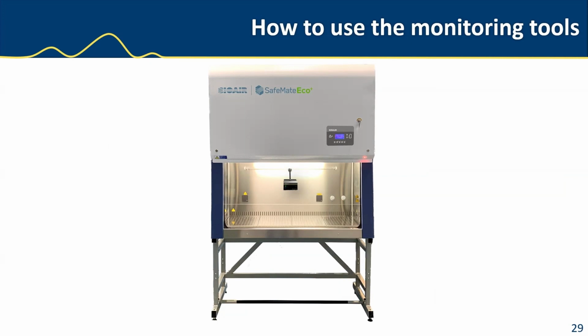Settle plates, implementing the settle plates into your biological safety cabinet. You see they're positioned at the work level. And then you have the active air sampling device, again, a remote active air sampling device that will connect into a vacuum system. Again, these are monitoring the process. Your particle counter is ensuring you have that clean air from your HEPA filters passing over the process. That's how I would go about monitoring and implementing these monitoring tools.